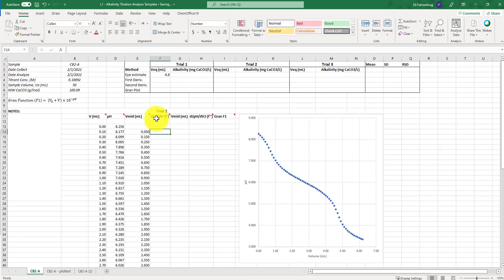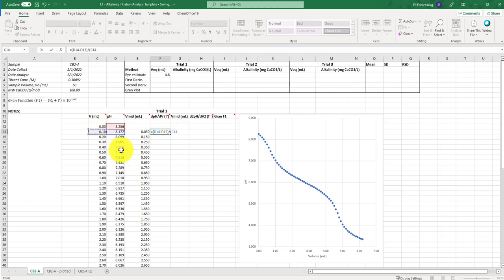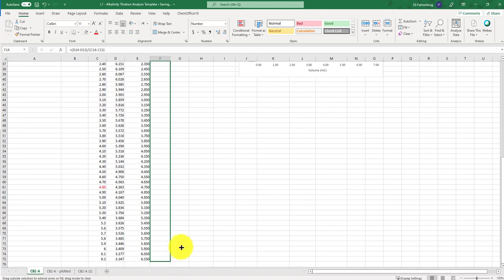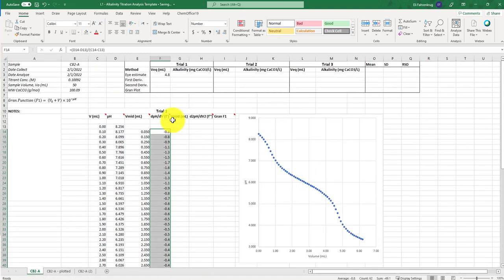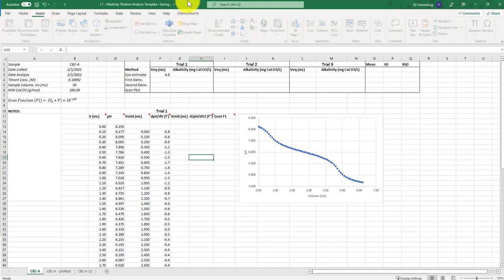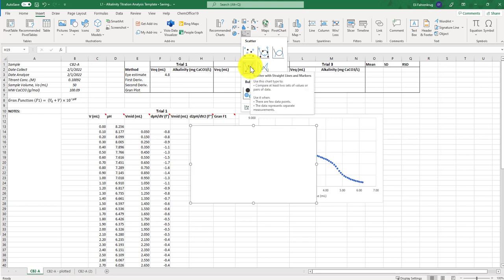I'm going to delete the placeholder and now compute the dpH/dV parameter. I'll set up the formula by taking the difference between sequential pH values and dividing by the difference between sequential volume values. Now we have the change in pH divided by the change in volume for each of these points — that's the slope, the rise over run. I can click and drag to compute all the way down.